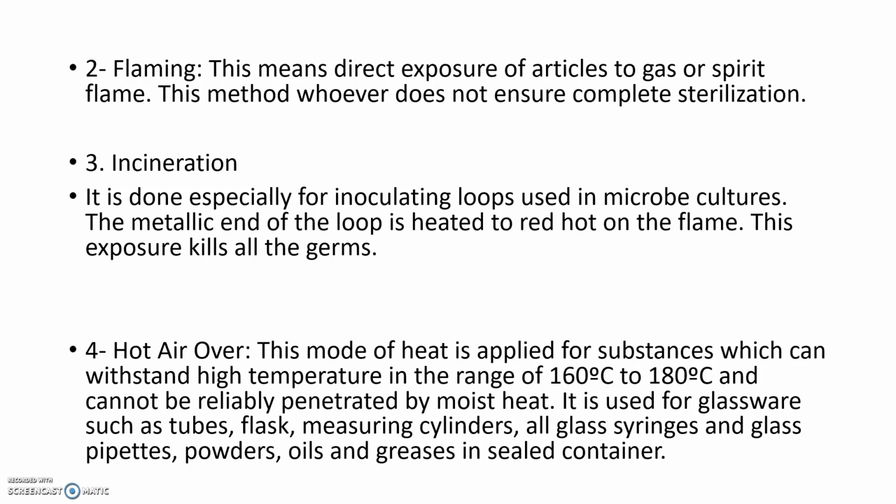And this cannot be reliably penetrated by moist heat. So high temperature can be used in hot air oven. It is used for glassware such as tubes, flasks, measuring cylinders, all glass syringes and glass pipettes, powders, oils and greases in sealed containers.